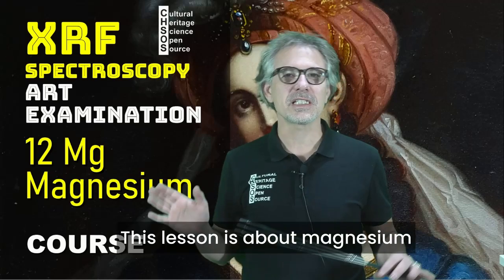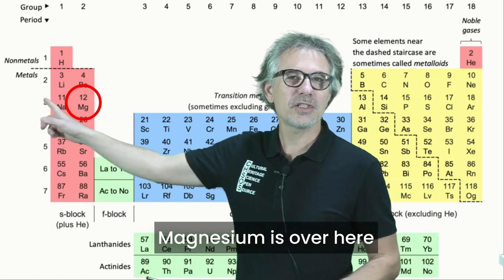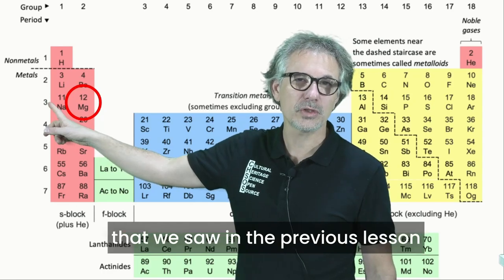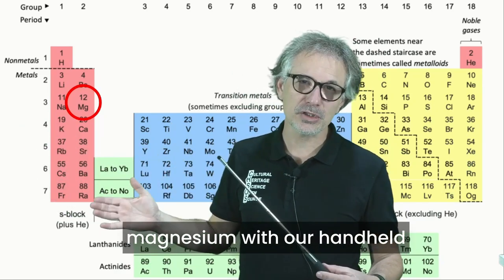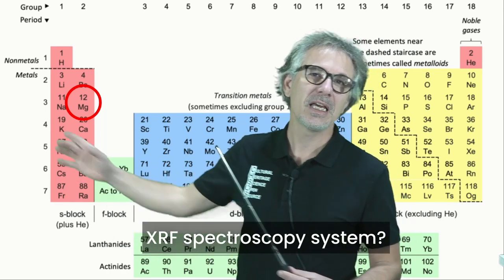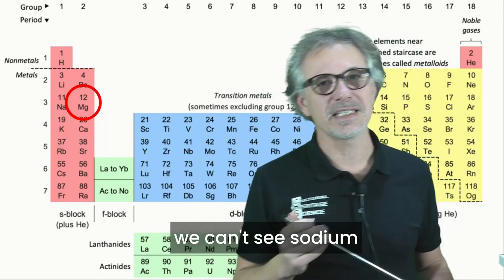This lesson is about magnesium, number 12, Mg. Magnesium is over here, number 12 after sodium that we saw in the previous lesson. And the big question is, can we detect magnesium with our handheld XRF spectroscopy system? In the previous lesson we saw that we can't see sodium.